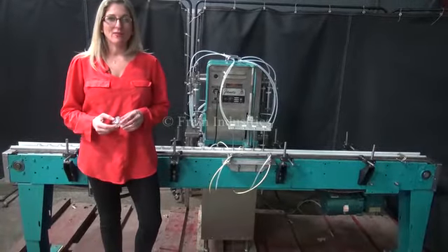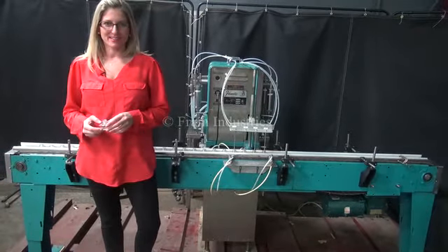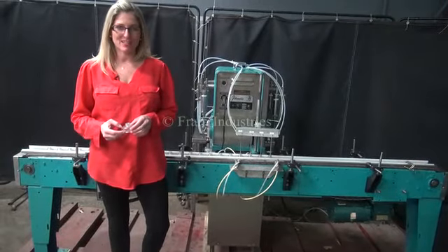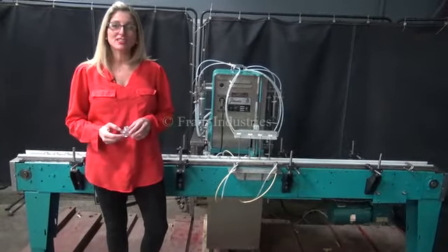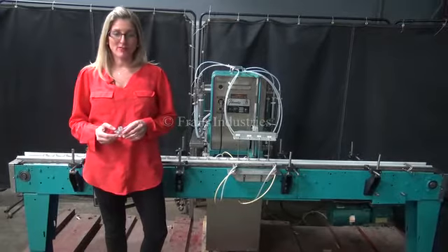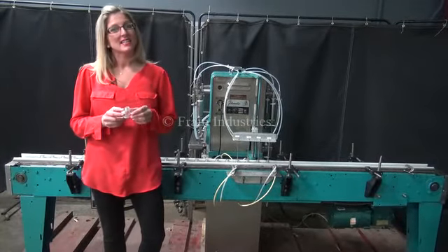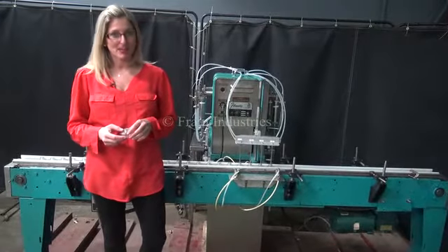Today we're cycling your Fill-O-Matic 4-Head Inline Piston Filler. We recommend you read the manual in its entirety before powering up the machine. The voltage is currently set to single phase 120 volts. Today we'll be filling 50 milliliters of water into this container and running it at 40 containers per minute.